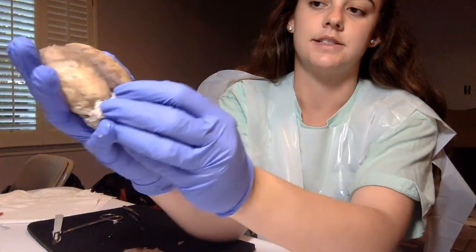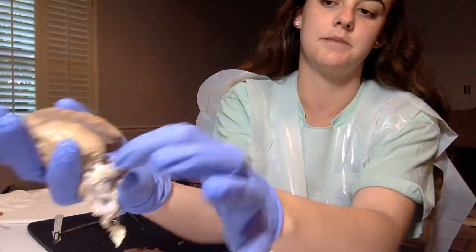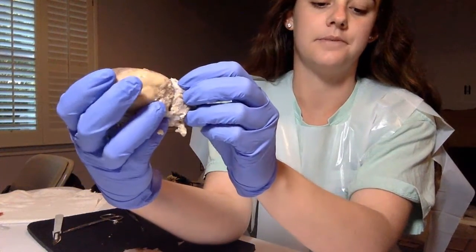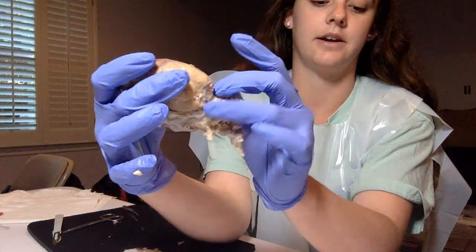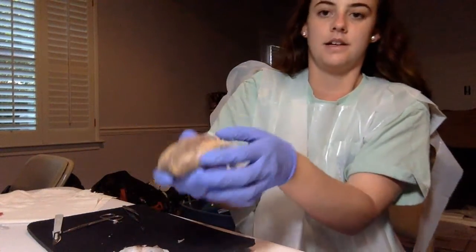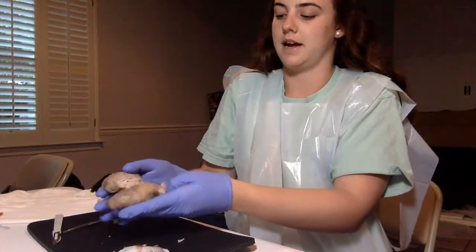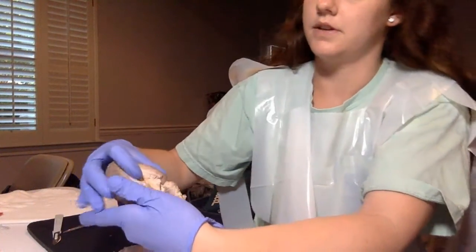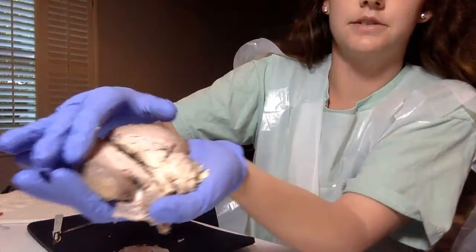And then across the bottom here, the brain is cut from where I was dissecting, but here would be the lateral, or the transverse fissure going across right here. So that is the outside of the brain, and now I'll be opening it up so we can see the inside, more of the inside matter, and I do my best to show this on the screen.